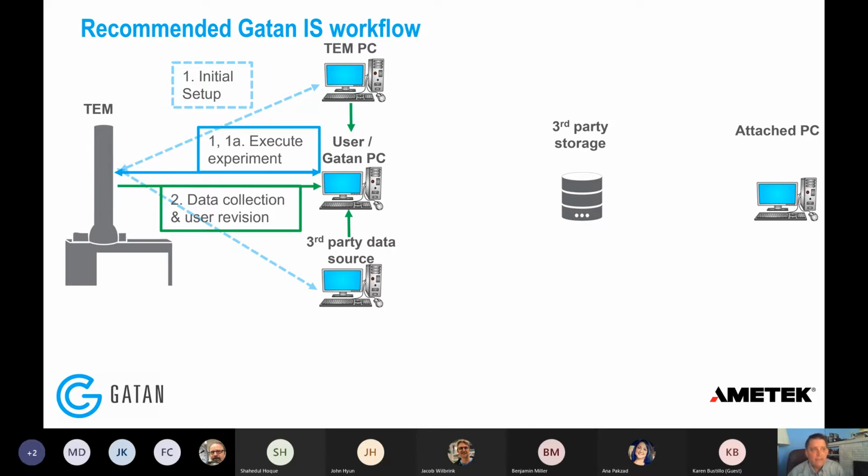So they can, for example, try to keep an item of interest in the field of view. They may choose to change the focus or the Z height or something, right? Change the temperature, change anything. But that's based on real-time feedback of what they see. With the way we've architected our system, we can simultaneously transfer data to a remote location. And my colleague Ben had a real nice presentation.